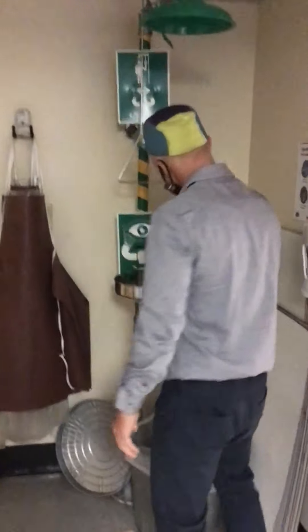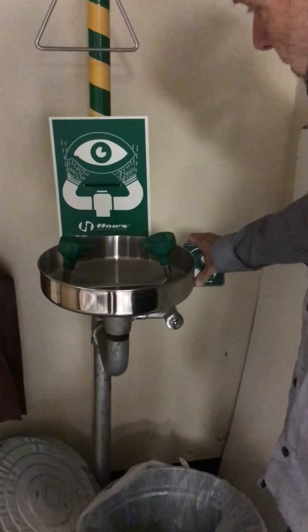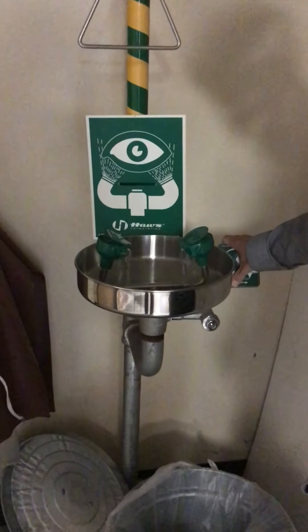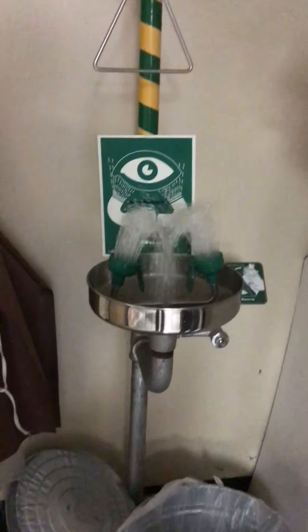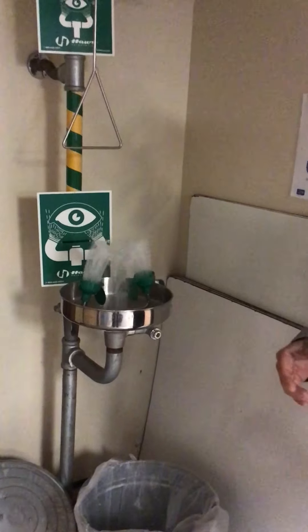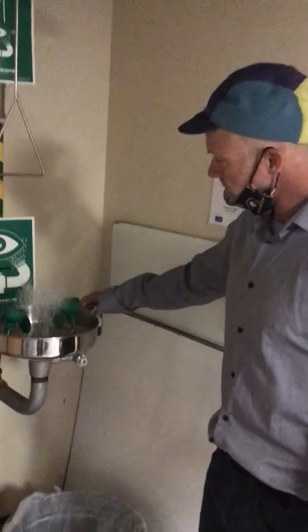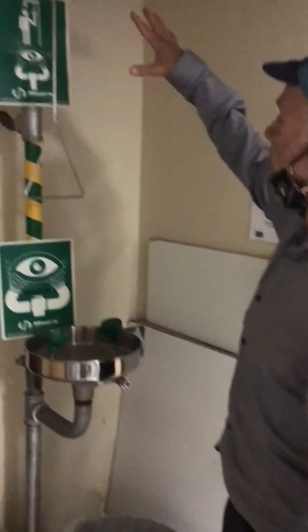Then we have the eyewash station. At the eyewash station, if you get something in your eyes, I need you to come over here. You're going to press the lever and that lever is going to activate the water. You're going to have your eyes in this stream of water for at least ten minutes to get all the stuff out that might have got into your eyes.